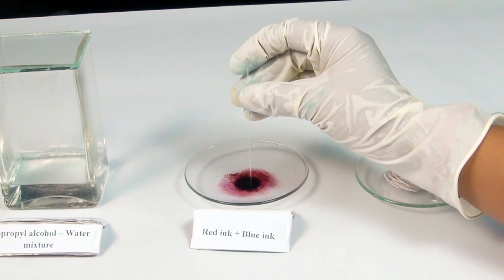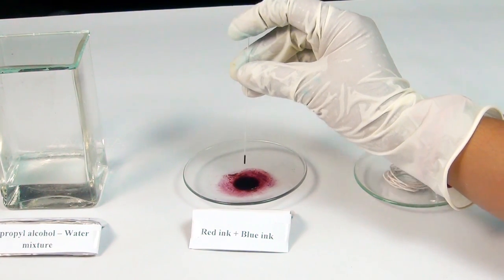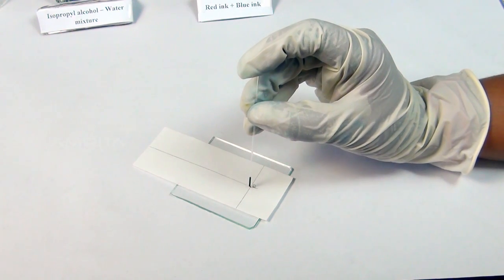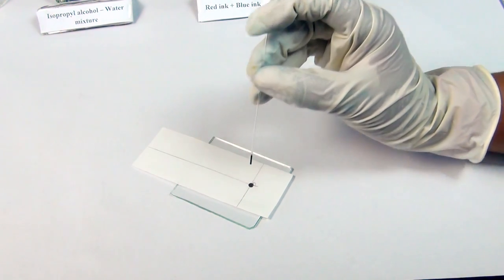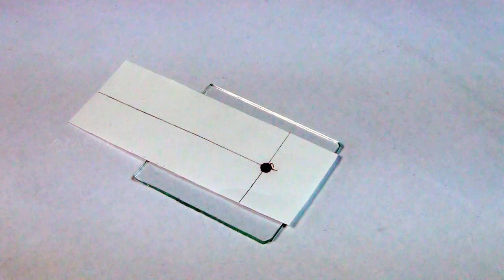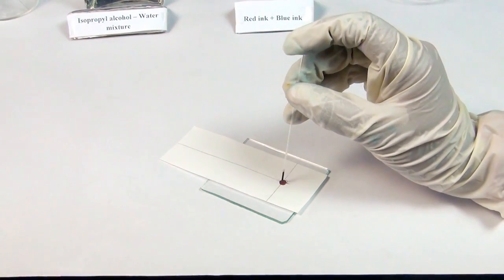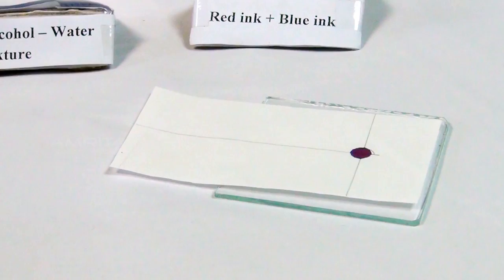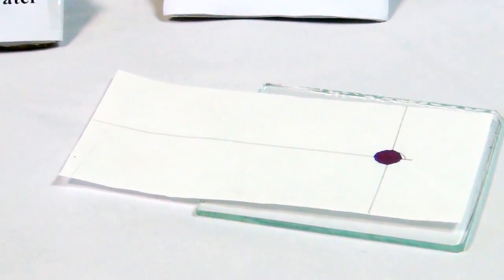Take the mixture of red and blue inks and apply it at the point. Allow it to dry in open air. Put another drop on the same spot and dry again so that the spot is rich with the mixture.